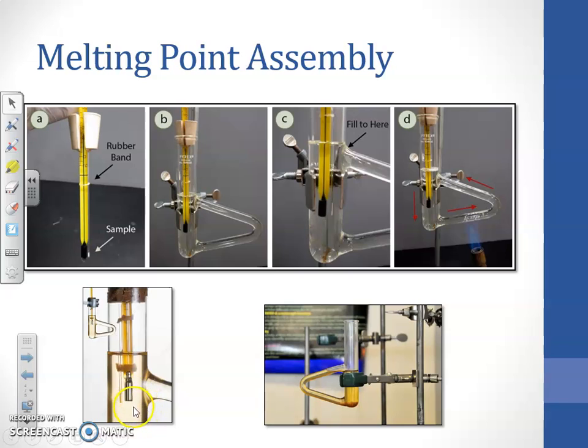So never wash this Thiele tube before the experiment, and never wash it after the experiment. Keep it as it is, drain it and keep it as it is.